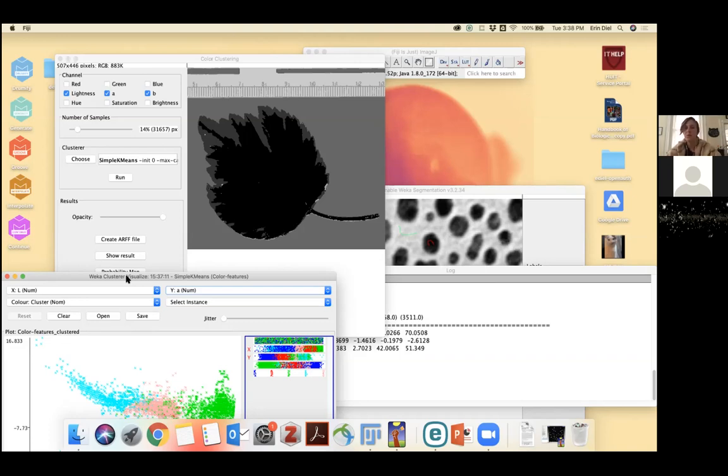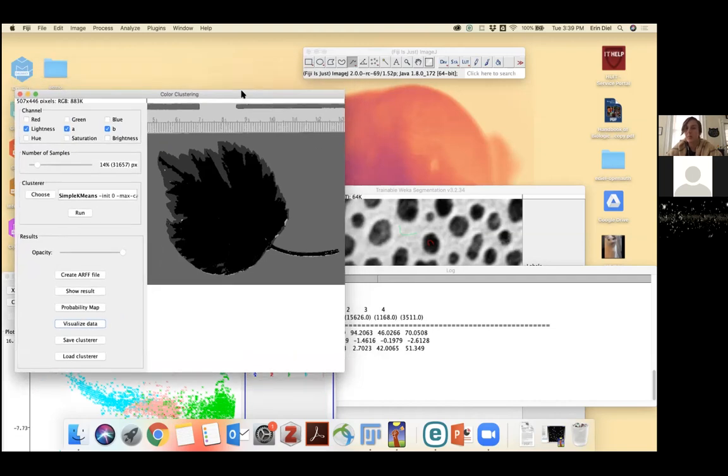We're happy to Zoom with you directly. You can ask questions in these office hours, or you can even do a screen recording and send that to you, whatever is easiest. But these are two examples of open source solutions to machine learning based classification, but they are certainly not the only ones. So maybe there are others who have had success with other types of machine learning based segmentation, but both of these should be compatible, I think, on any platform. And they don't require any licenses. So if anyone has questions, I can answer them. I can maybe go through different parts of the software if they're interesting. But that's all I had to say.